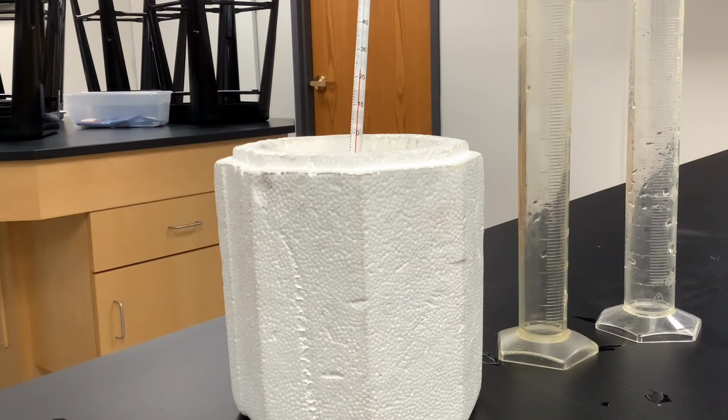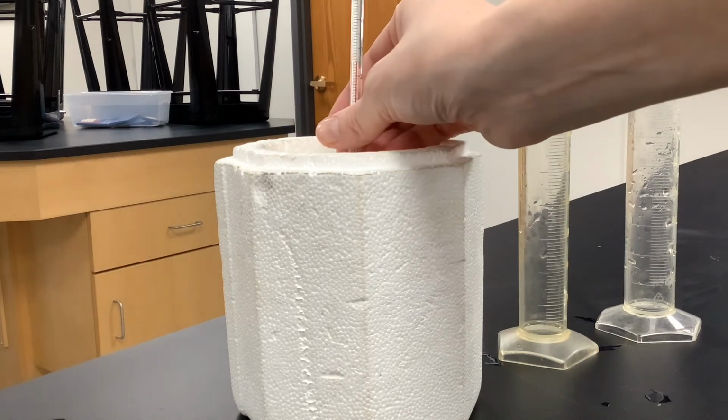So when we take a final temperature of the calorimeter water, we know that's the final temp of both the calorimeter water and the metal cube. Looks like it's still climbing.